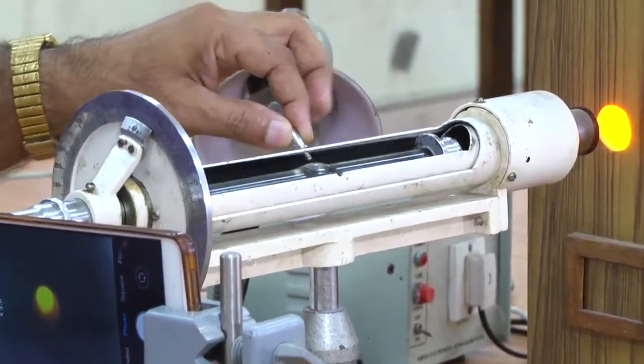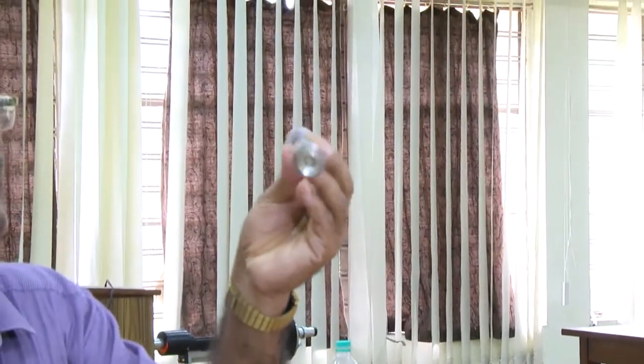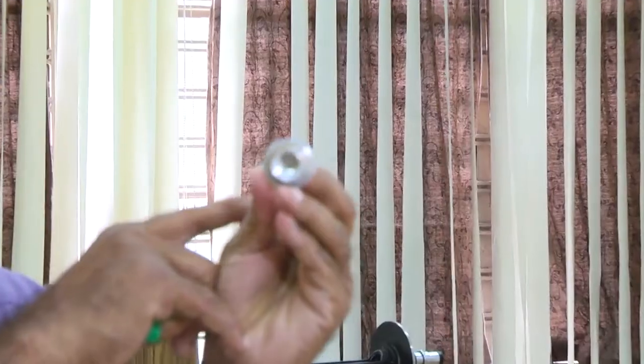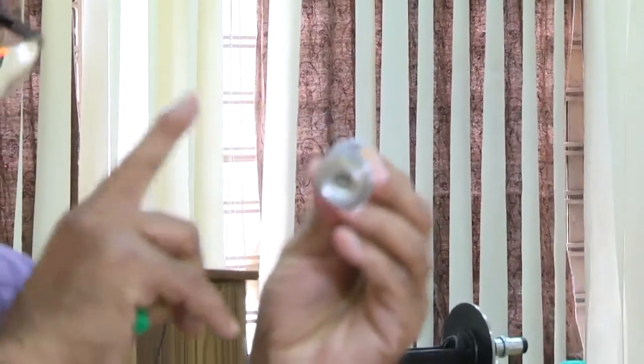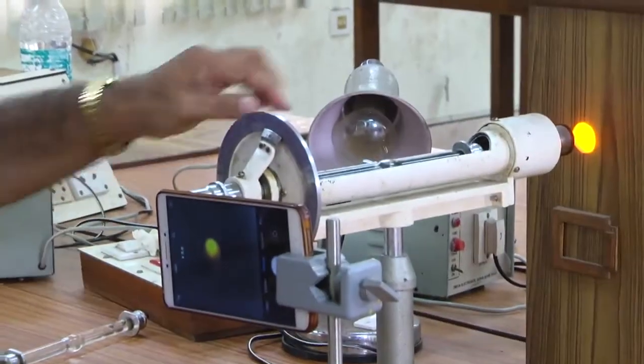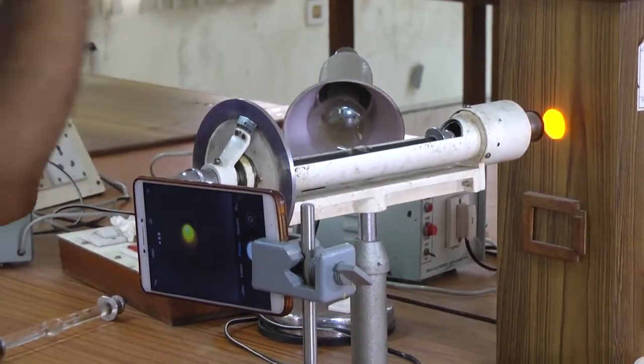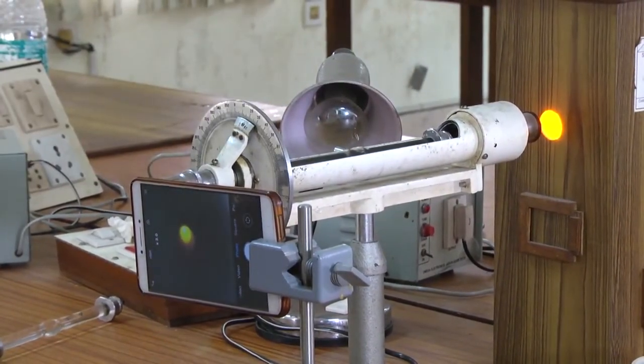And then basically you see this is the tube containing solution. Water is there, but here the same thing we have put with a solution of sugar of 20% intensity.